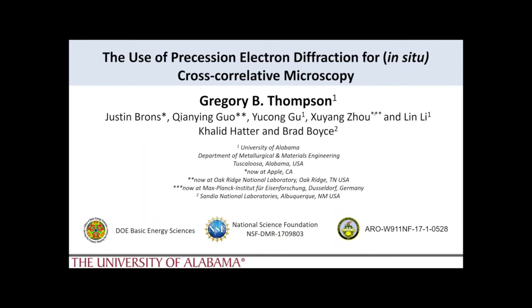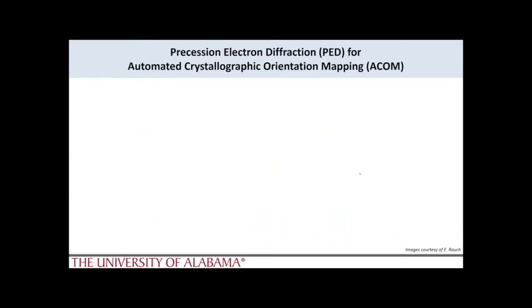All right, so what I want to start out with is, I'm going to talk more on the application side of PED, but I recognize that some of you may not have attended the first two webinars in this series, and so I just want to quickly recap how precession electron diffraction works, so that its application, which I'll show in the remaining slides, will make more sense. So for those that know this, I apologize. Hopefully this will be a nice summary though.